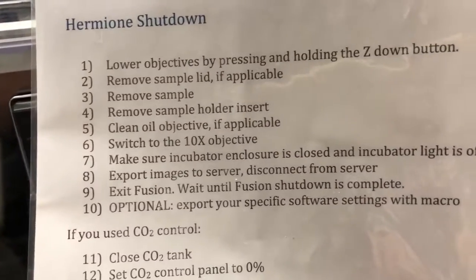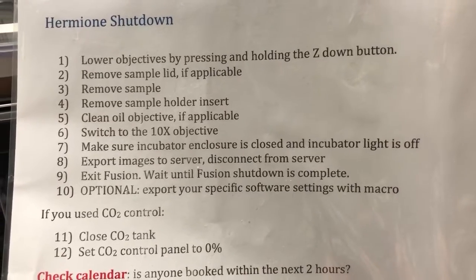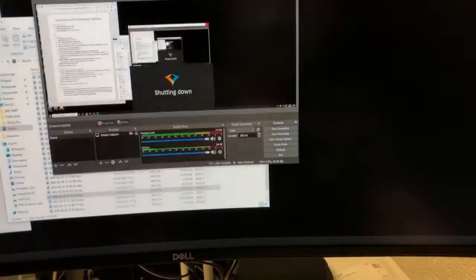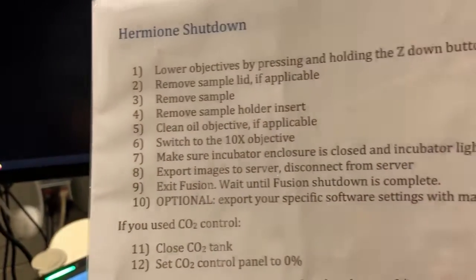Then we're going to export images to the server and disconnect from the server — I've already done that in this case so I don't need to show you in the video. Then we're going to exit Fusion and make sure that the shutdown is complete. To exit Fusion we just X out here, and you'll see we get a shutting down message. We want to wait until that's complete — the microscope will make a bunch of noises as that's happening.